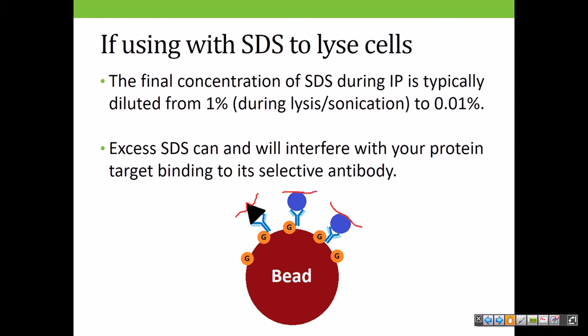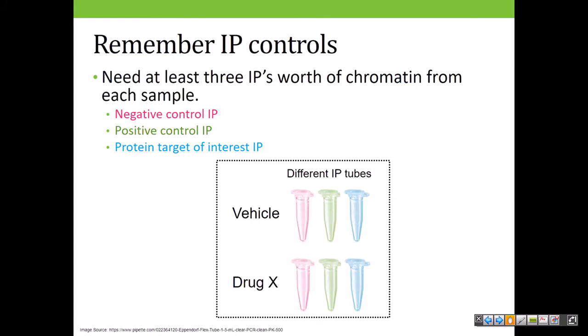It depends on your target. But for the ones that do tolerate SDS, almost all the protocols I see recommend 0.01% during the IP. And again, it's because SDS can and will interfere with the interaction between your antibody and its target.